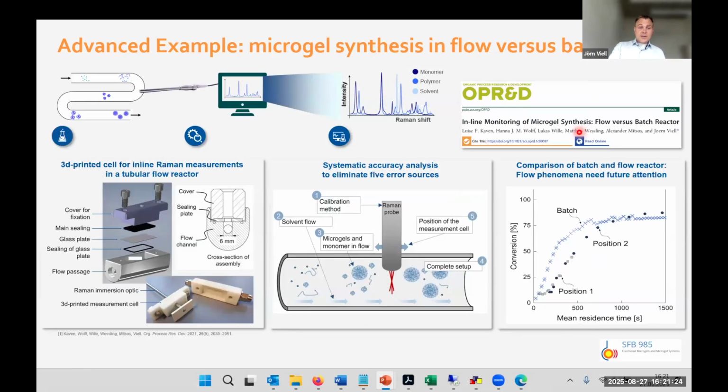And then you could also analyze flow versus batch reactor setups and improve or support the design of such things, because you know what is particles, what is liquid concentrations, and you can measure at different positions in order to mimic reaction progress and analyze for optimal operation.